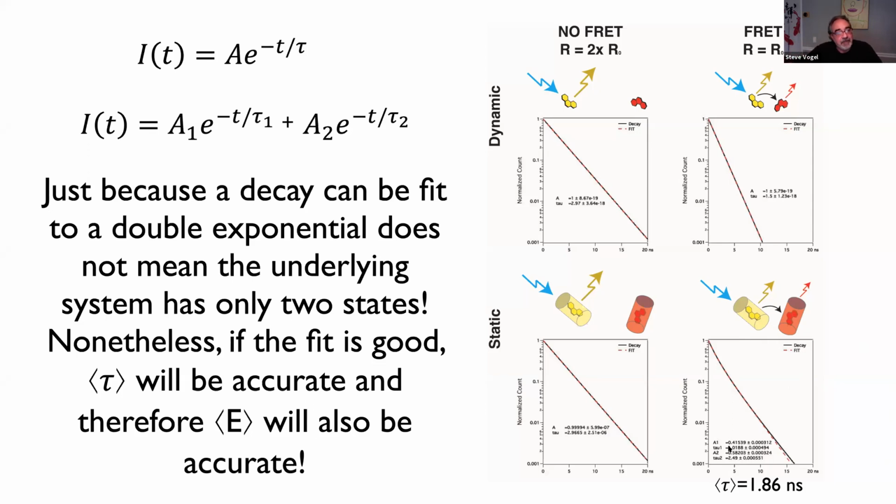does this mean? And all of this arises from the fact that kappa squared is not 2/3 when you're doing fluorescent proteins, and you can't assume that it's 2/3. And so you're going to have much more complicated things. And because of those complicated things, this idea of fitting it to a double exponential and then interpreting it in terms of amplitude 1 and amplitude 2 falls apart, right? And can't really be applied here.